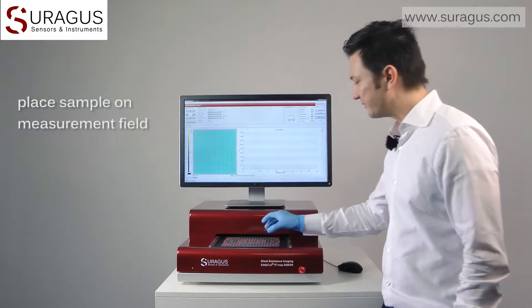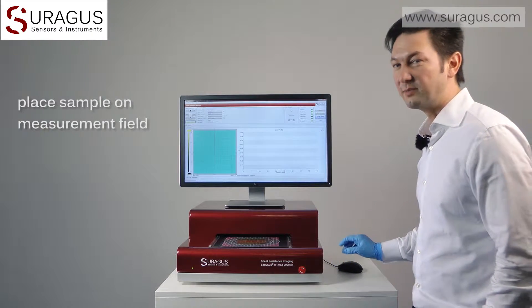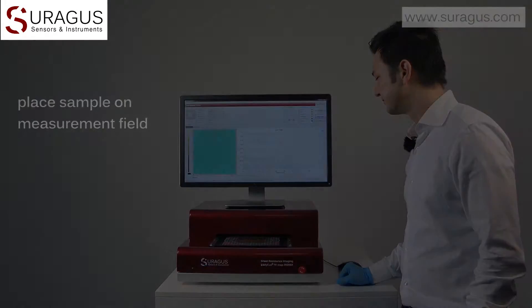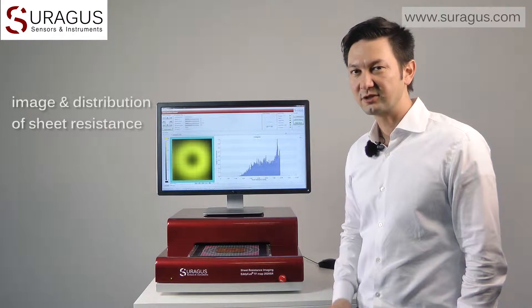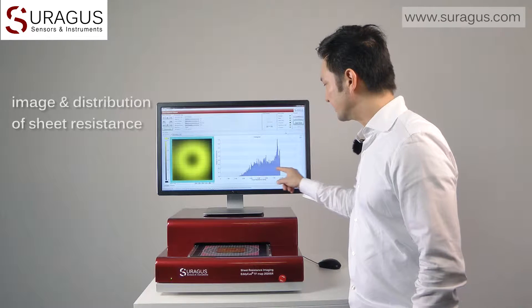Now we place the sample on the measurement field and start the measurement by hitting the start button. The sample stage is slowly moving the sample in x direction while the non-contact sensor is continuously moving across the sample in y direction. Since we apply a very weak electromagnetic field for the measurement, no contacting of the sample surface is needed at all. After a short time the measurement scan is completed and the software shows us an image and the distribution of the sheet resistance.